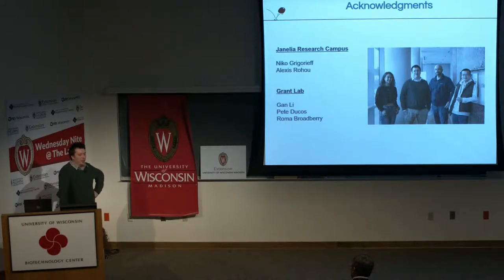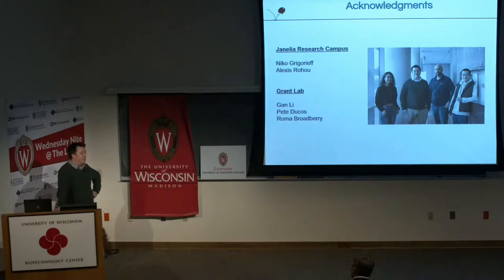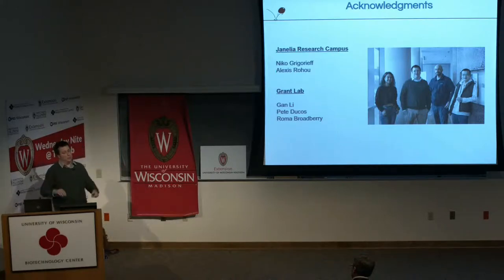So there are ways you can change it. You can use different grid types, and that will reduce the motion. There are apparently now grids that do not have that motion. So what it seems to be is a characteristic of the ice, not the sample. The ice has some pent-up strain, possibly relative to the grid. When you put the beam on it, it semi-liquefies again, and it can move, and that strain comes out, and that's what causes that motion.